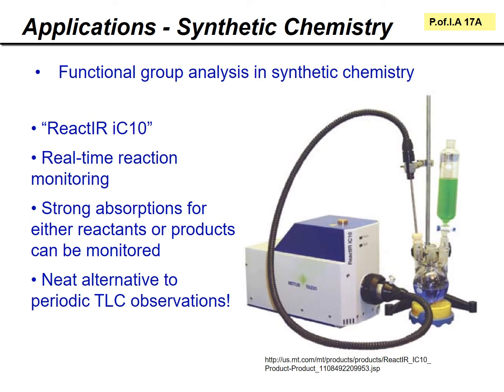Now here's a much more useful and down-to-earth application. You will have done this, I'm sure, at some point. In synthetic chemistry, infrared is a quick and convenient way to monitor how your reaction is going. If you're trying to install a key functional group into your substrate, you can monitor how that's going by looking for its absorption. This little device here is a nice one for real-time reaction monitoring. A nice little three-necked round bottom flask where there is a probe, reactant mixture being fed in, and that can be sampled and monitored as the reaction proceeds.